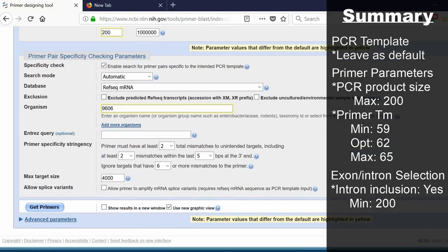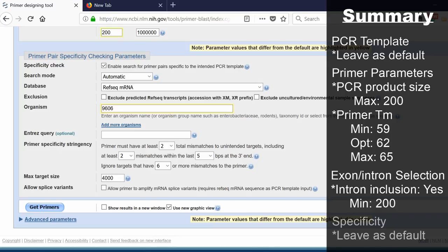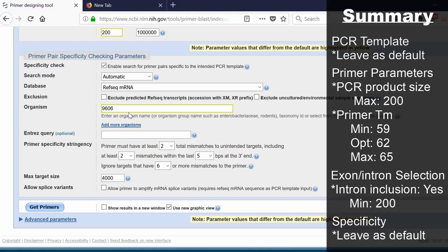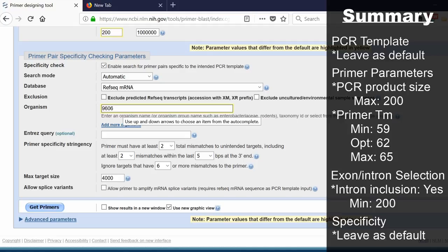For the final window, you don't really need to focus on this. This is more getting into the specifics of the primer pairs itself. What I do recommend is that you check that the organism option has the unique ID for your organism of interest. 9606 is the number for Homo sapiens, humans.